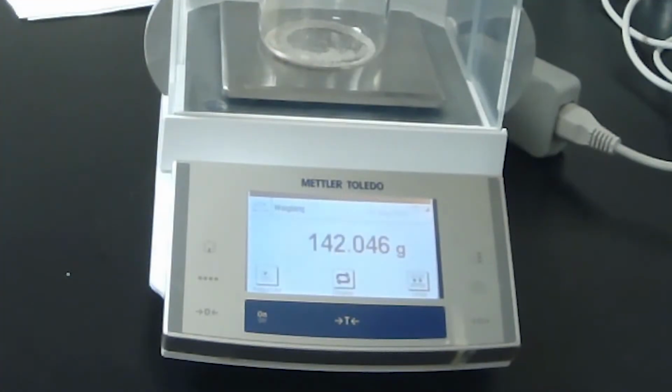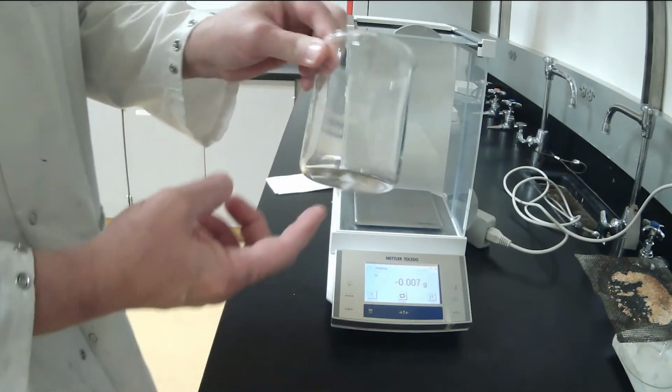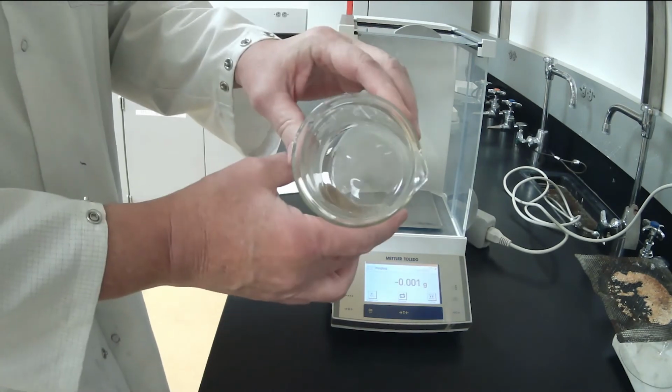All right, please record this weight. It should be a little bit less than what it was when I put in the entire unknown sample. And we're going to make the assumption that all the weight that was lost from the previous weight to this weight is ammonium chloride. So we now know how much of our unknown was ammonium chloride. The next part of the lab is to try to separate the two compounds that are still inside.